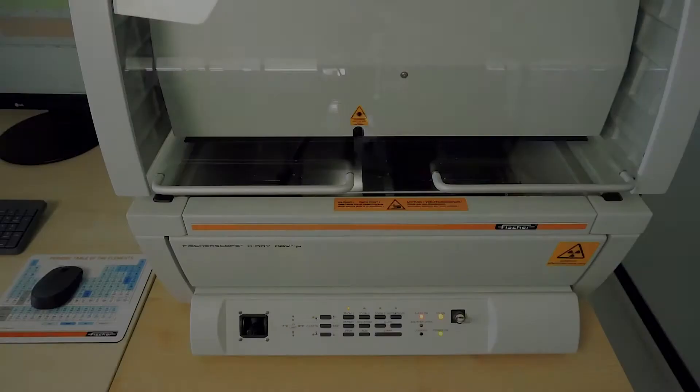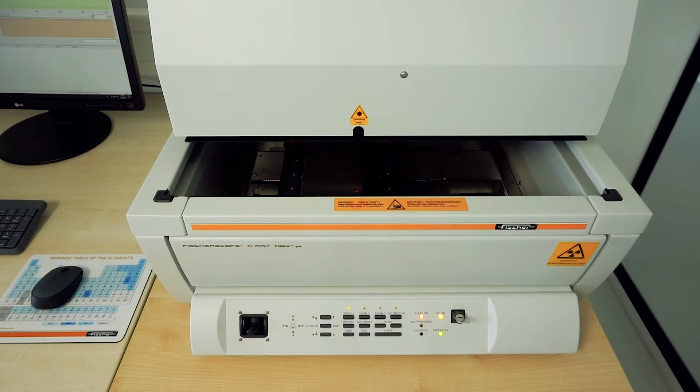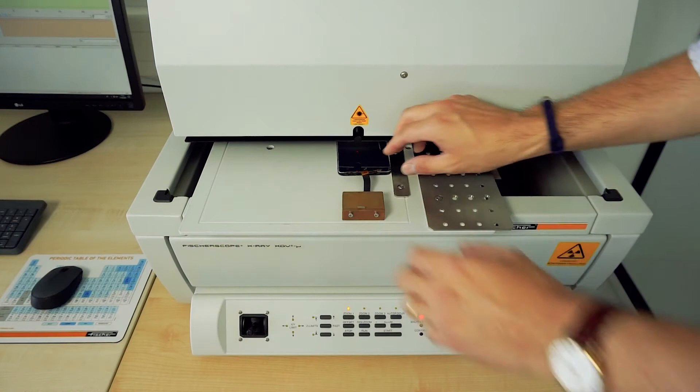Now another sample of the same type can be inserted. Thanks to the support of pattern recognition, the sample does not have to be positioned accurately. The rough definition of the measuring position is enough. Now, all 20 measuring points of this sample are automatically measured.